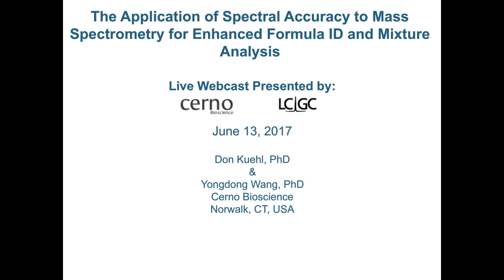We've done this work also with, for example, labeled isotope work. We've also done it with other applications where we have mixtures. But in the sense of quantitation, as it's defined in conventional mass spec, there's not really much value that I think we can add there today.